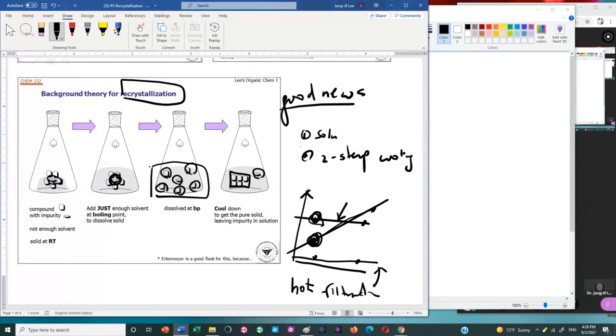Okay? So solubility is key. So hopefully now you connect already given things in this perspective. Why did we talk about solubility? To choose a good solvent. But in what sense? All the things we have done are there, but here, in this main moment, that's the moment you actually remove impurity.